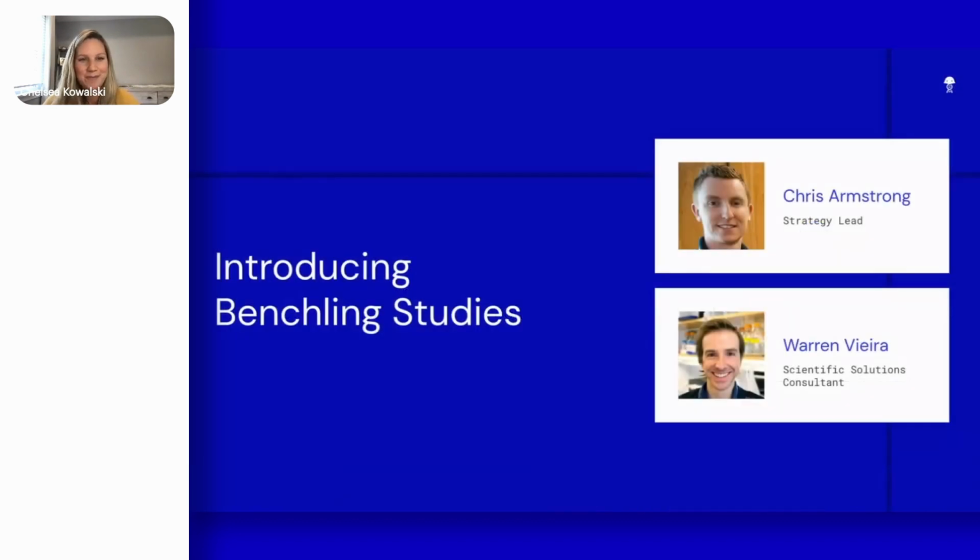All right. Thanks, Ashoka and Chelsea. That was an amazing demo. I love the visual flow builder. That's going to be great for teams in dynamic environments.